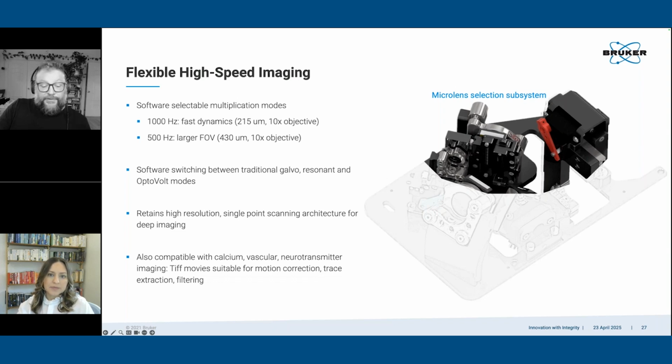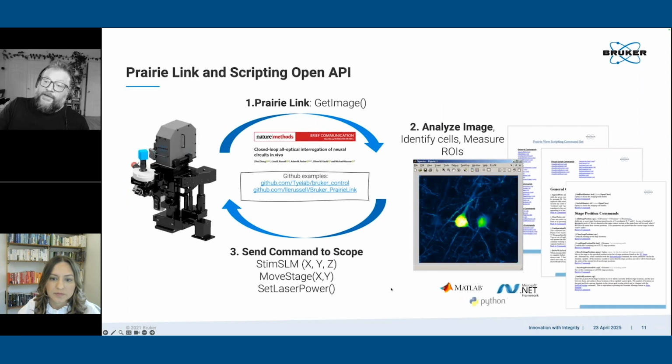Most commonly, it's done post hoc. There are issues with that. So I'll pull this back up here. A couple different things to consider. One of them is drift. If your field of view is drifting over time, I don't know if that's the stability of the implant or whatever, but that can happen.